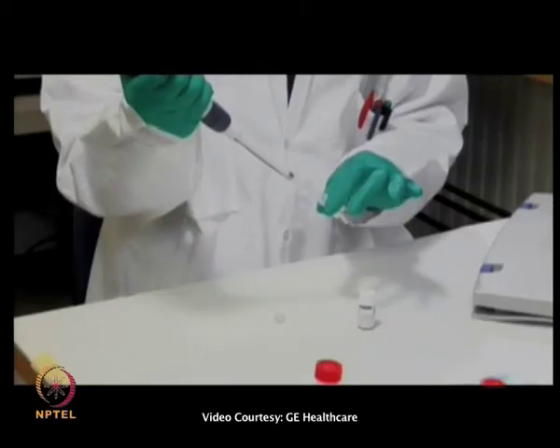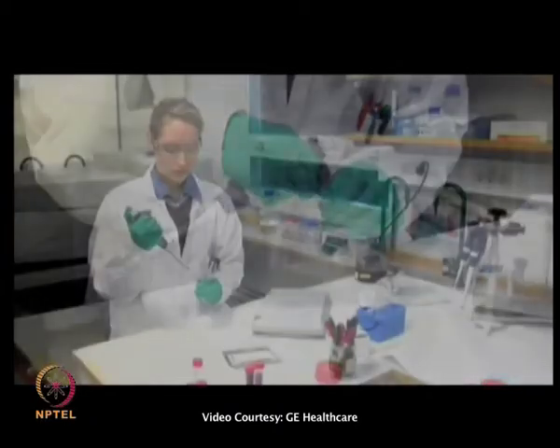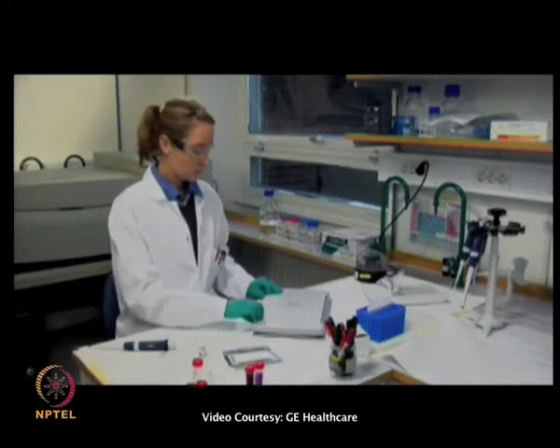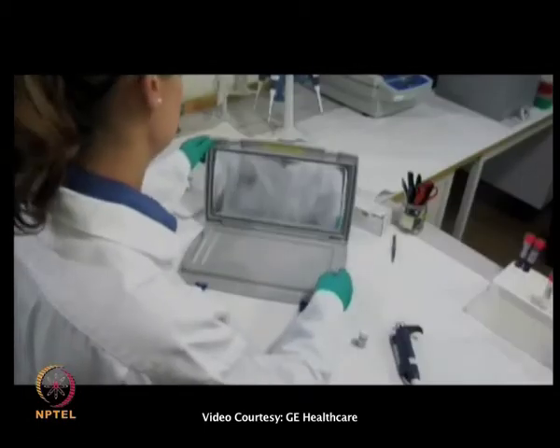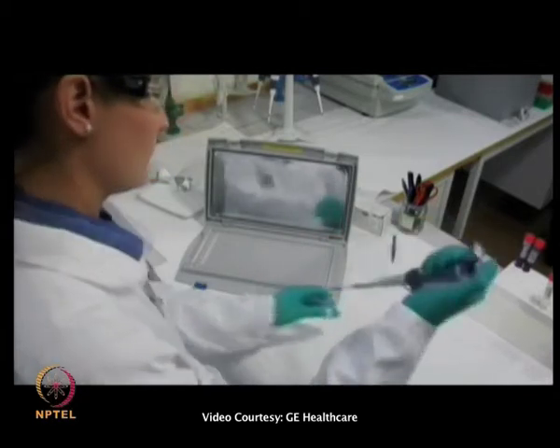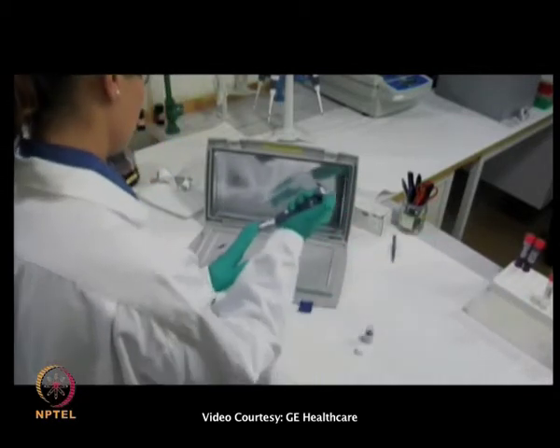The samples are now ready for 2D gel separation. The first step in 2D electrophoresis is to prepare IPG strips for rehydration. Prepare the streak rehydration solution by adding IPG buffer corresponding to the pH interval of the strips used, and add the solution in the lanes of the rehydration tray.